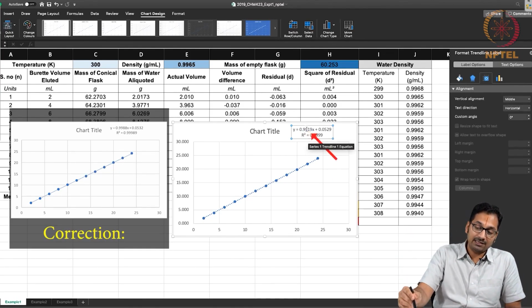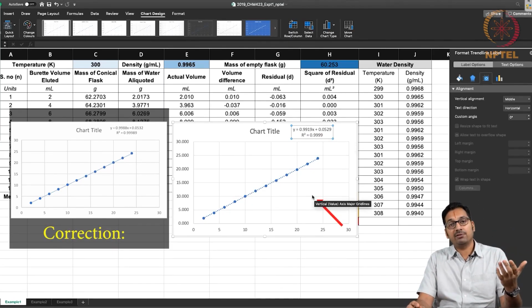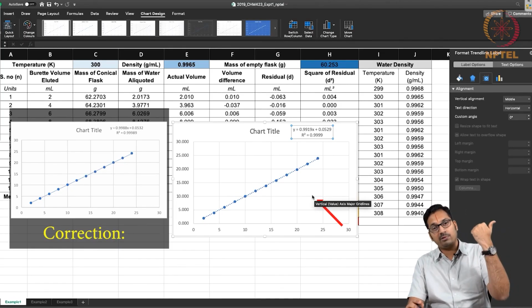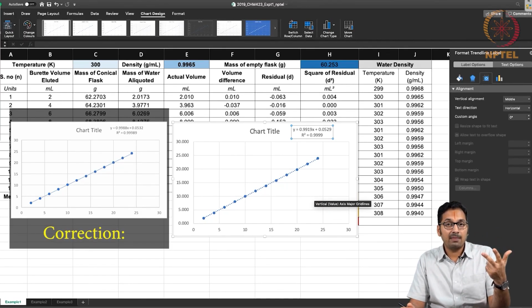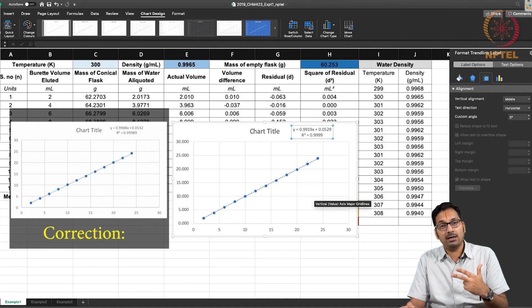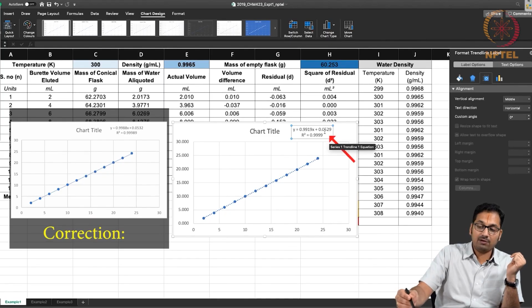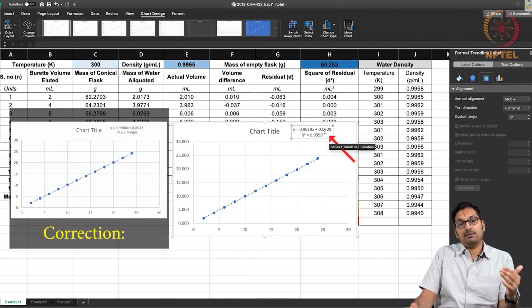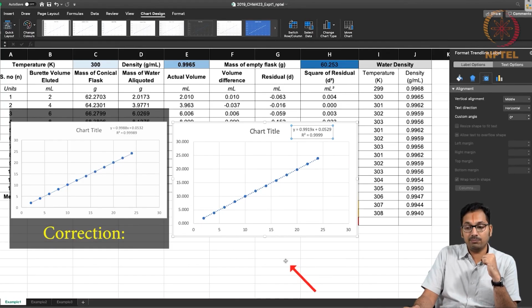But you are able to realize there are deviations that come up largely because there have been differences due to various different things. Of course, due to systematic errors that could come from the weighing or from the aliquots where you added 1 drop more or less. On the other hand, maybe your temperature was fluctuating during these measurements, which once again ends up having errors that might increase if the temperature kept on changing. And the standard offset could have come from the basic fact that the burette or the weighing balance was miscalibrated, which is why before starting any experiment, calibrating the instrument becomes important.